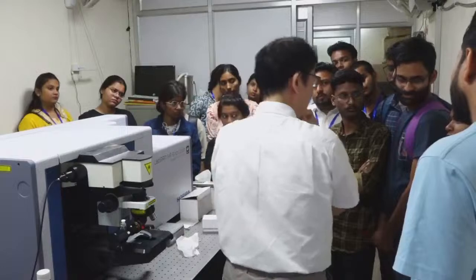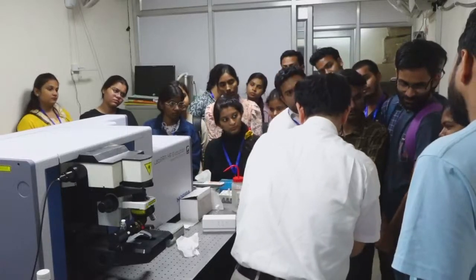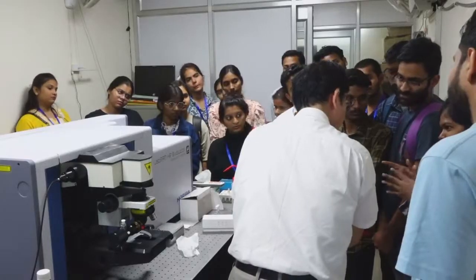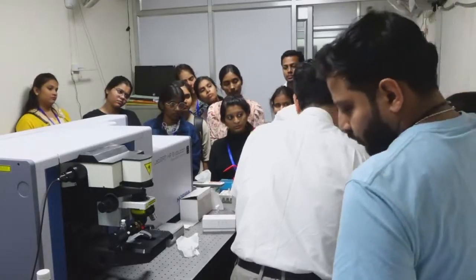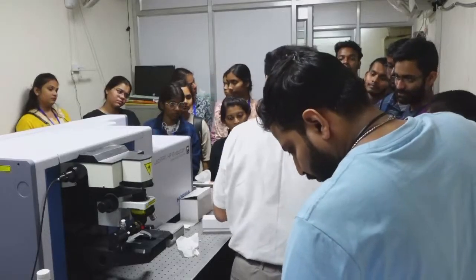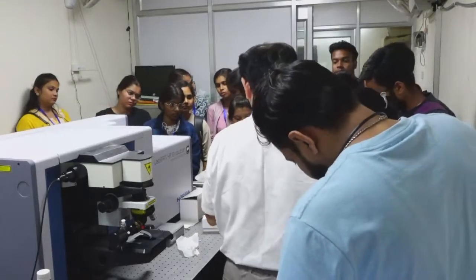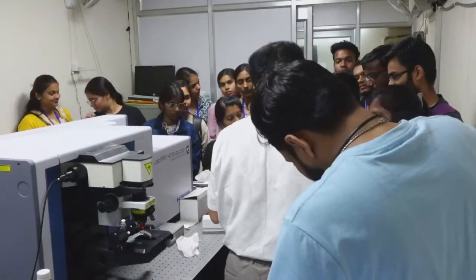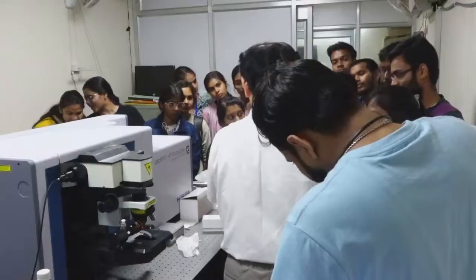Sir, I have a question. Can you explain more about backscattering? How is it happening? The scattered light is going in a particular direction. If light falls on a sample, light will scatter in all directions. So how is it going in a particular direction in backscattering?